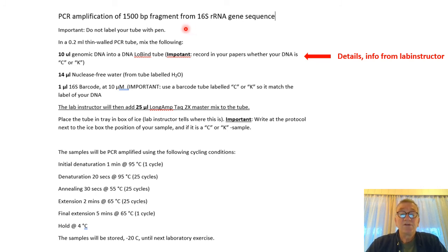So today you also will run this PCR. You will start the PCR and then you are finished. So later when the PCR is finished, I will pick it up and store it for next week.